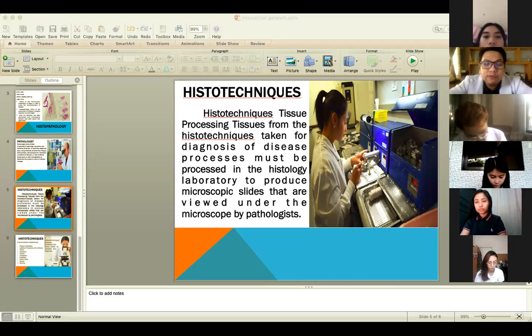Another form of streaking class or spreading is the one you performed on AFB slides. Yung coiling, slide, wire loop, specimen, and then you perform circular motion on a desired measurement of a sample on a slide. Okay?